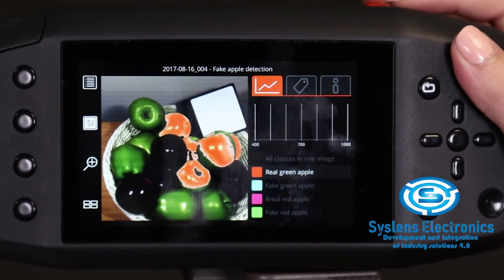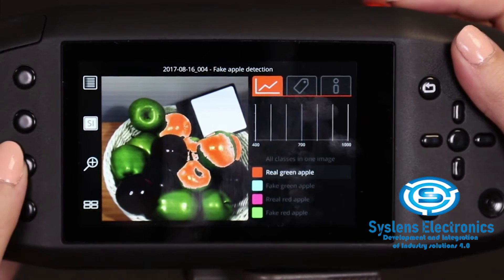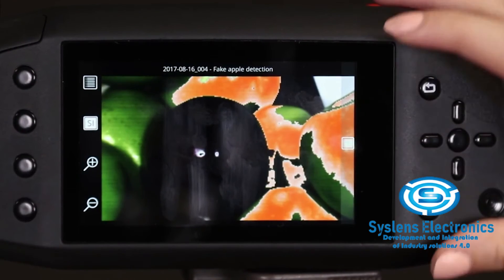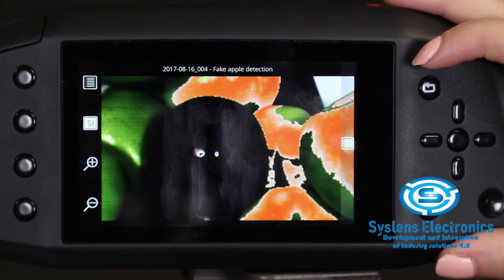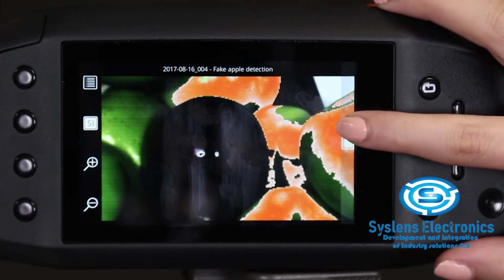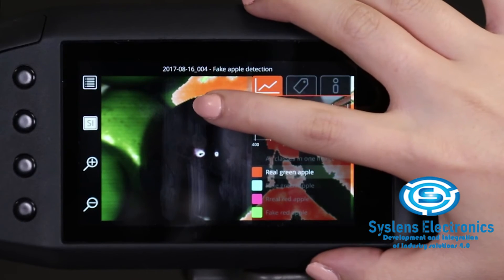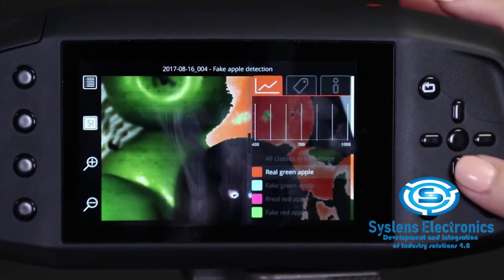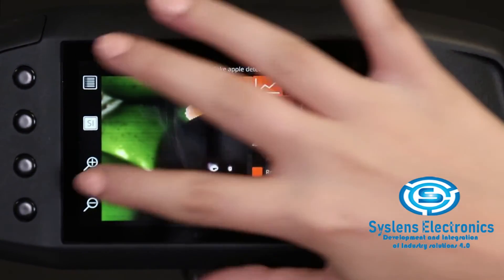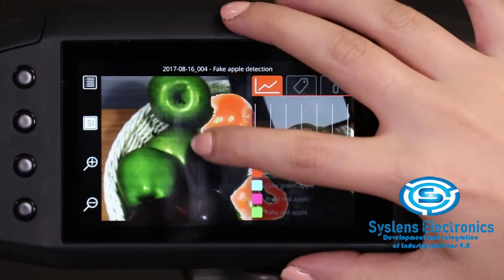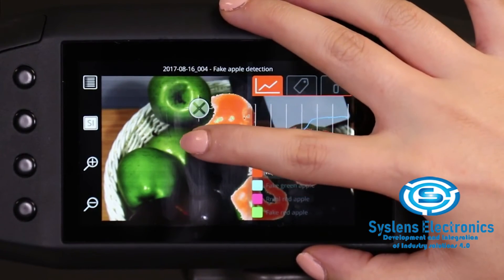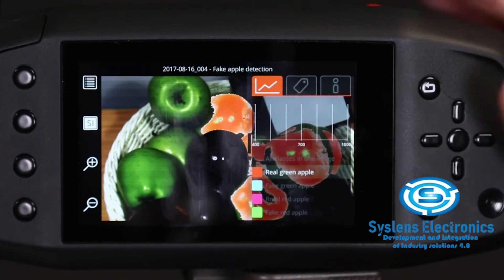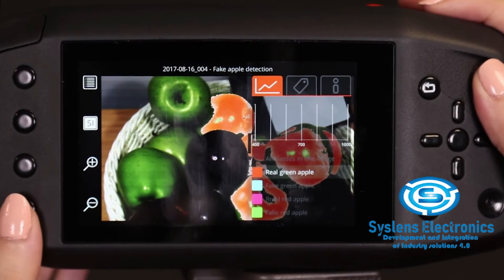To help examine the data better, you can zoom into the picture by pressing custom 3, and out again by pressing custom 4. When you zoom into the picture, the spectrum graph is minimized, but you can restore it by touching the menu icon on the right side of the screen. You can also navigate around the image while zoomed in by dragging your finger on the screen, or by using the navigation buttons. To change the pixel selection, simply touch another part of the image. To remove the selection, press the X in the selection symbol. When zoomed in, pressing and holding the custom 4 button will return you to the full view.